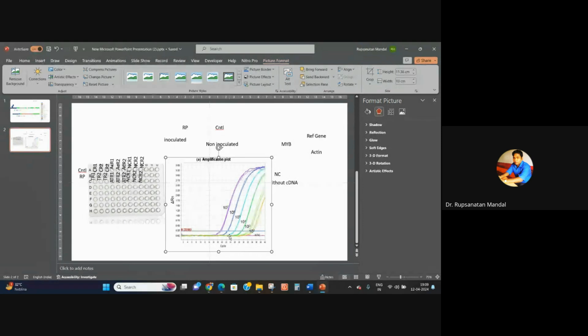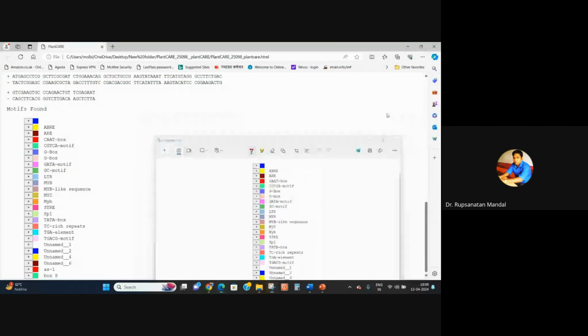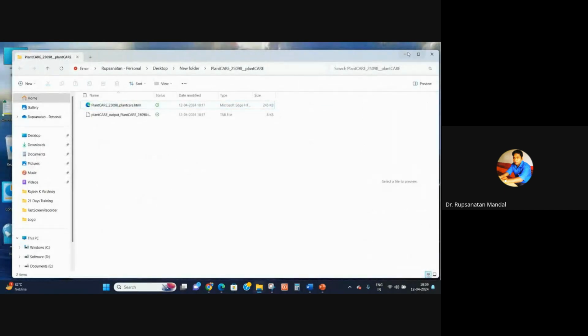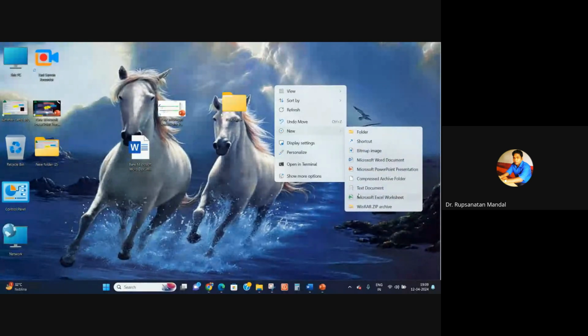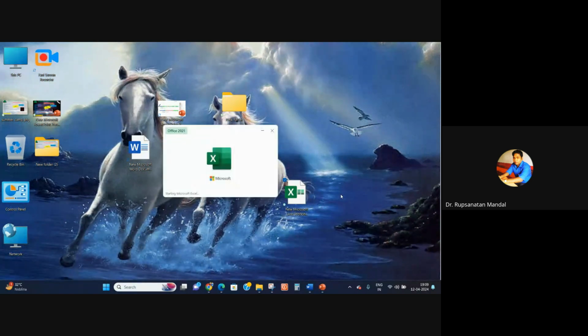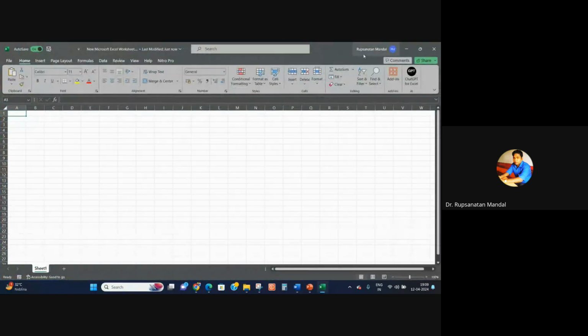Now we are talking about how you find some CT values in the CSV file. Okay, so now we are discussing the CT value, and then we analyze the experimental data.